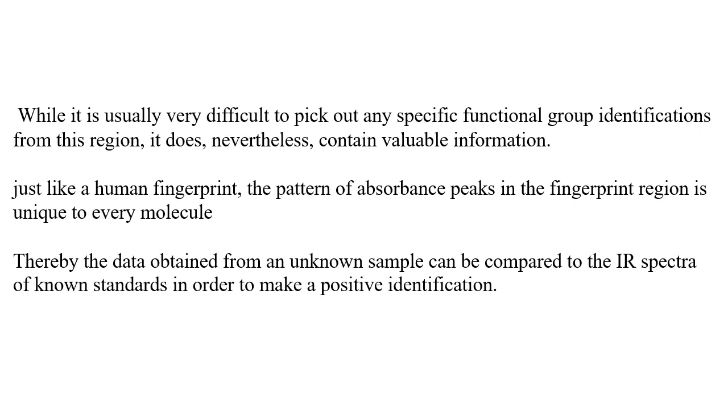Thus, as the spectrum obtained in the fingerprint region is unique for a molecule, as the fingerprint of a human is unique for that particular person, we can identify the molecule by comparing its fingerprint spectrum with the IR spectra of known standards. That is how a molecule is identified by using IR spectra.